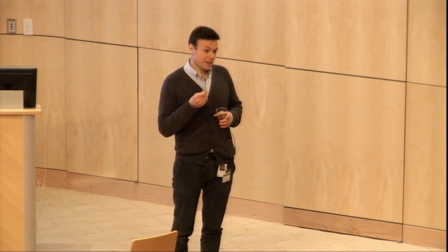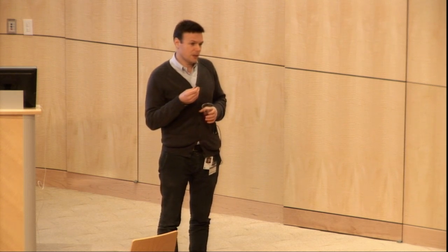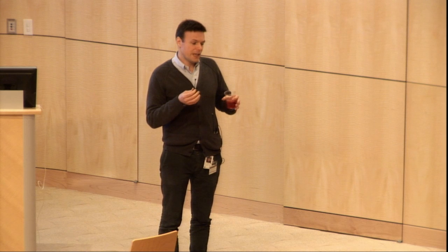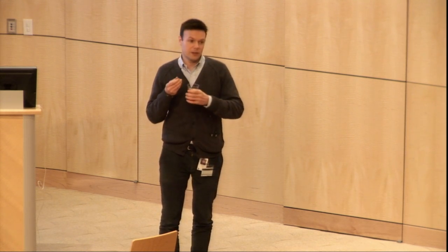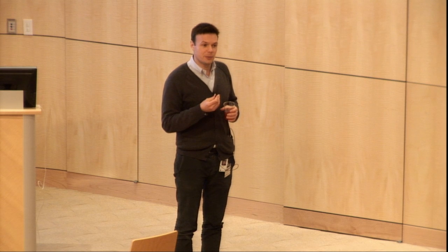And the second thing that we're really excited about is all these new methods that are coming out of Steve Carr's proteomics group to make draft molecular networks pretty quickly and pretty cheaply. Because why not just run all our algorithms on custom protein-protein interaction data from the proteomics platform? That would be much better if we can generate those data cheaply and with good resolution, right?